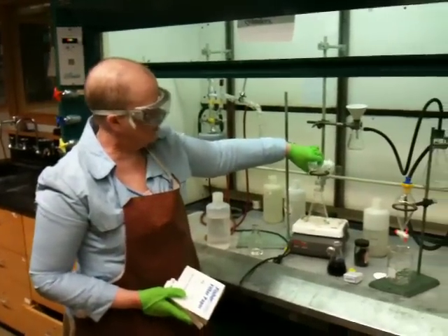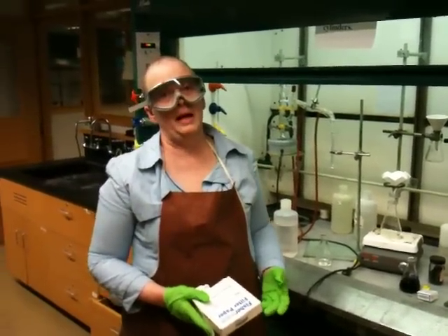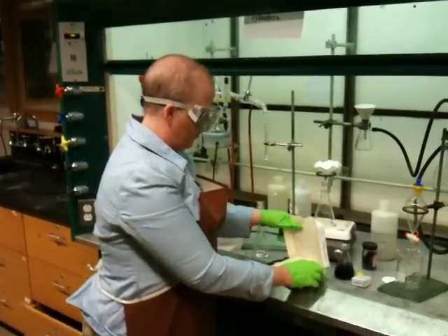You can also do this when you're doing a cold gravity filtration if you're trying to remove some particulate matter from a solution. So if you want to make fluted filter paper, it's very simple.